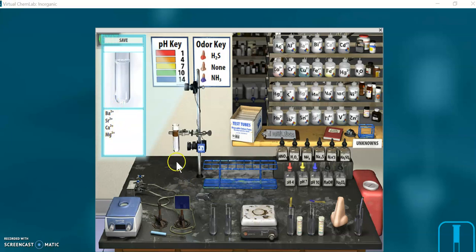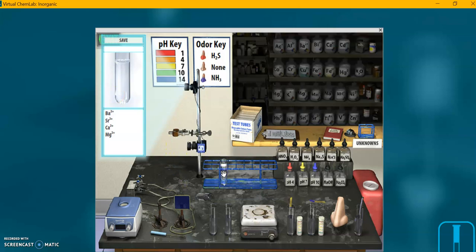Now the worksheet tells you to put the test tube in the blue rack, but that disables all the functions down here pretty much. I'm going to put it back in the test tube stand.